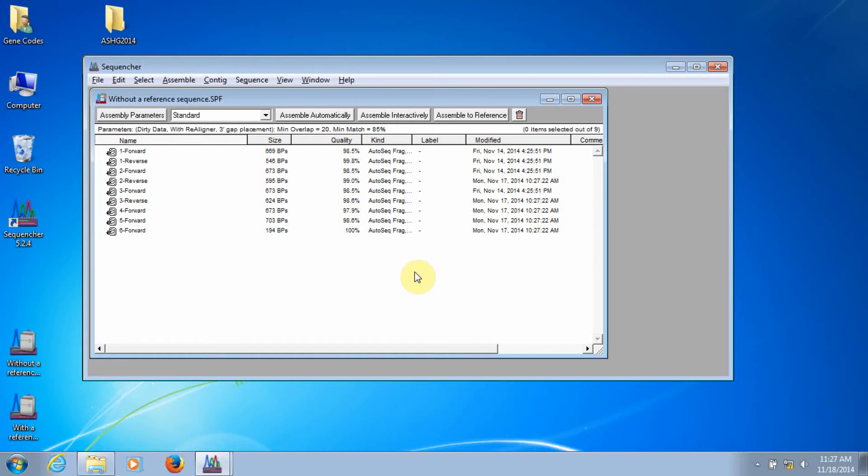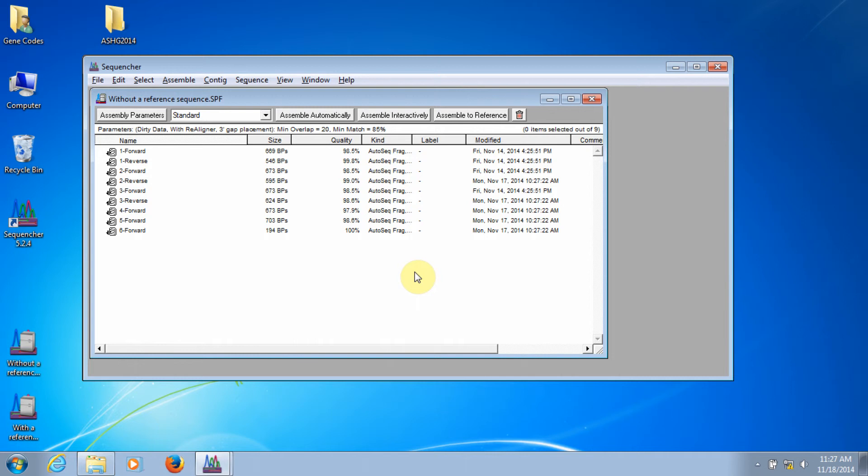Hi, this is Jason from GeneCodes Corporation. Today, we're going to look at how to assemble a contig in Sequencher. This is the third video in the tour guide of Sequencher series.